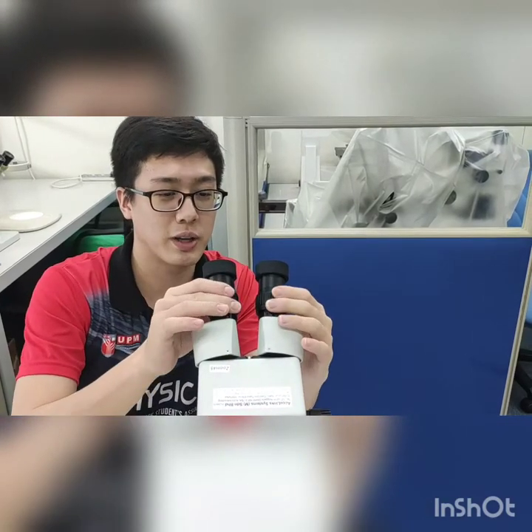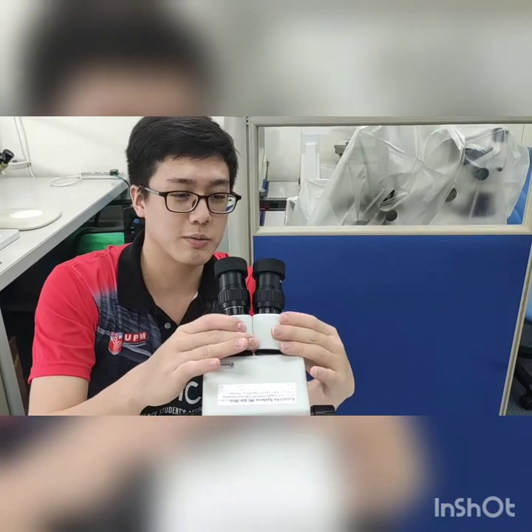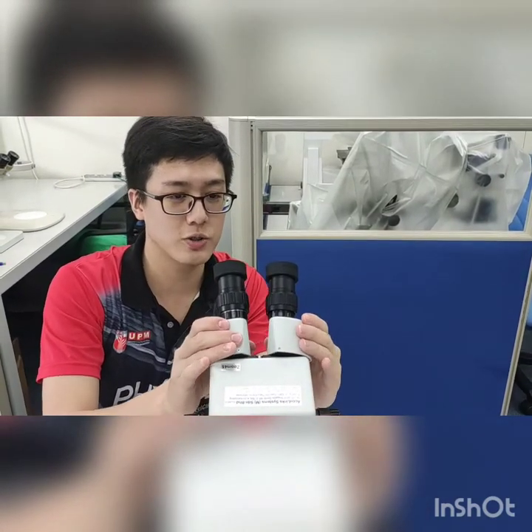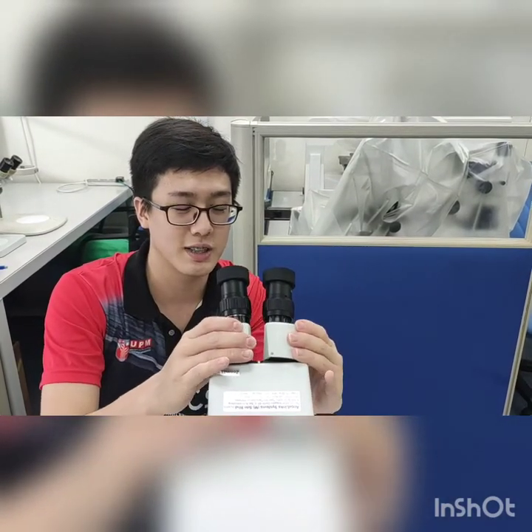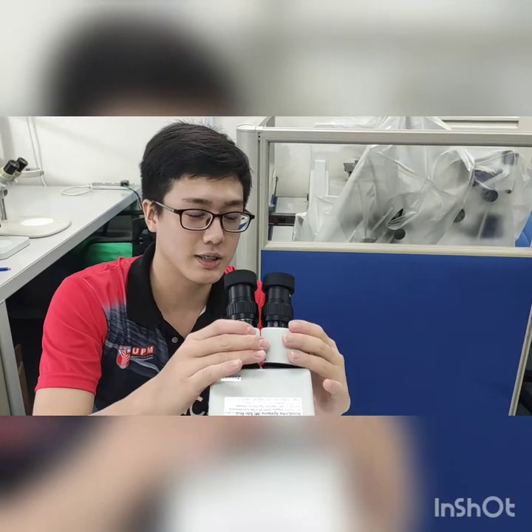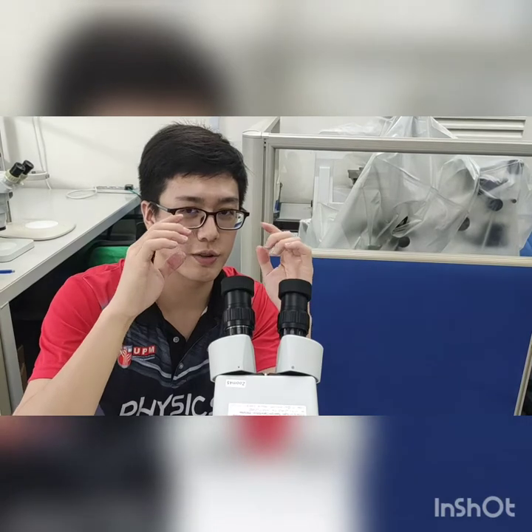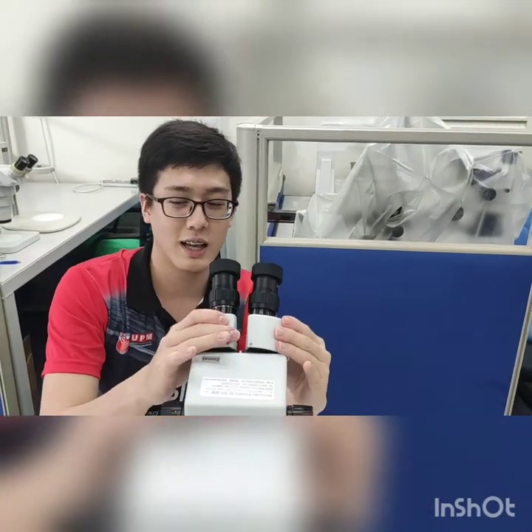Other than this part, we can also adjust this part, so that you can see here, the interpupillary distance. An average interpupillary distance of an adult is about 63 mm. This microscope has an interpupillary distance setting of 55 to 75 mm, so of course we can adjust to suit ourselves.